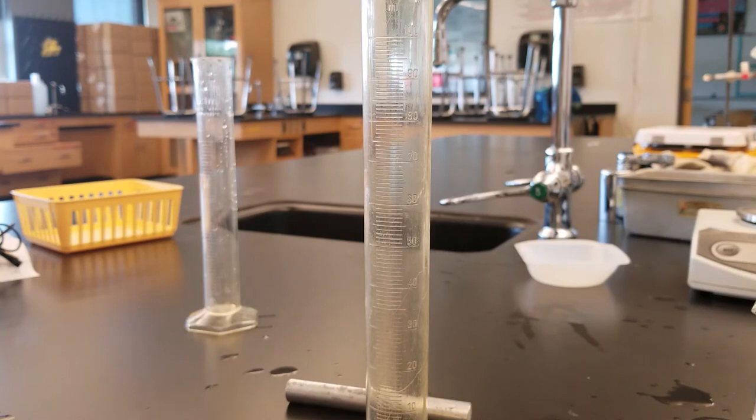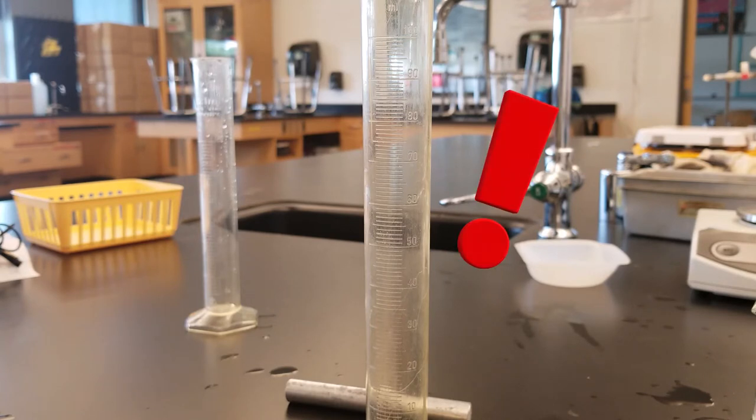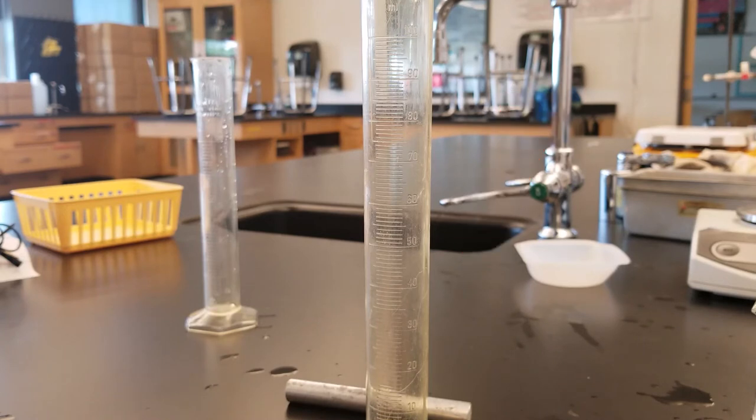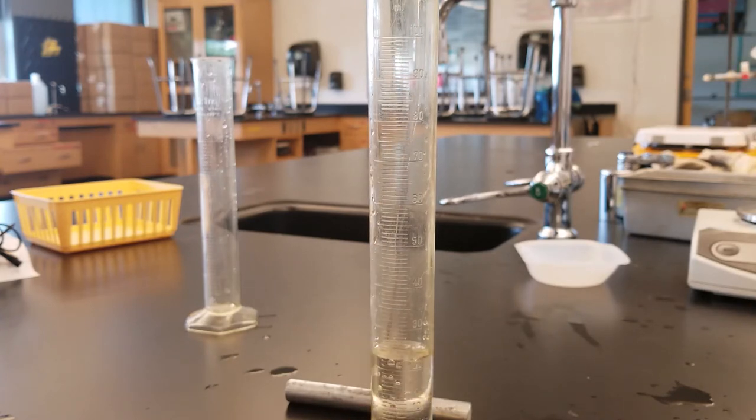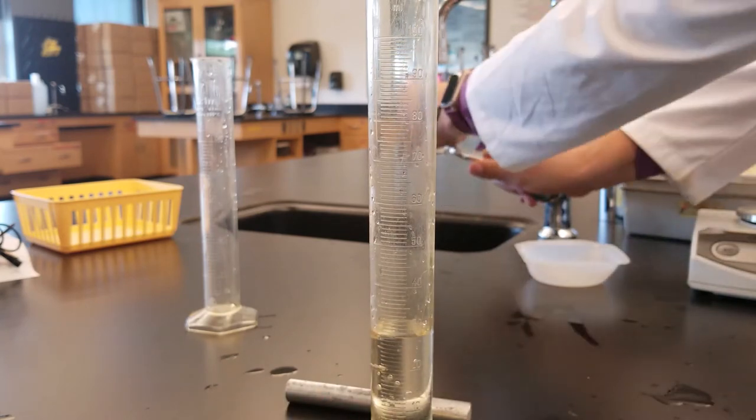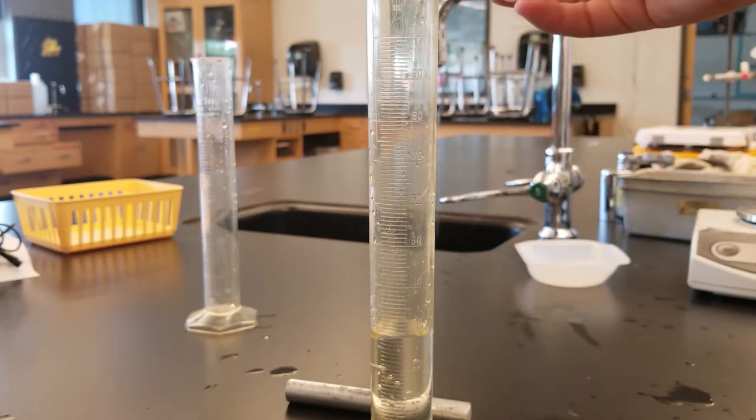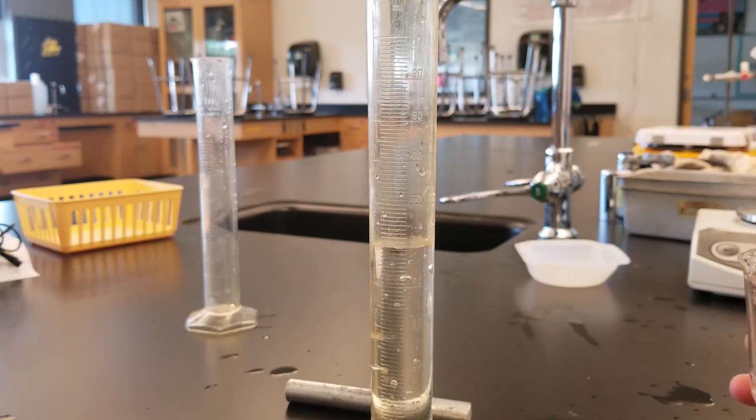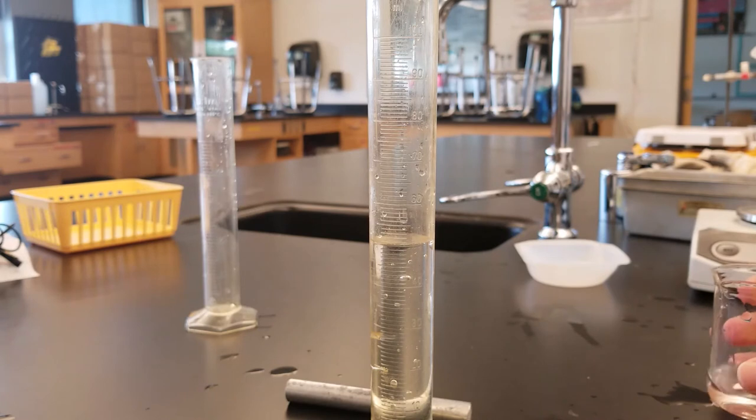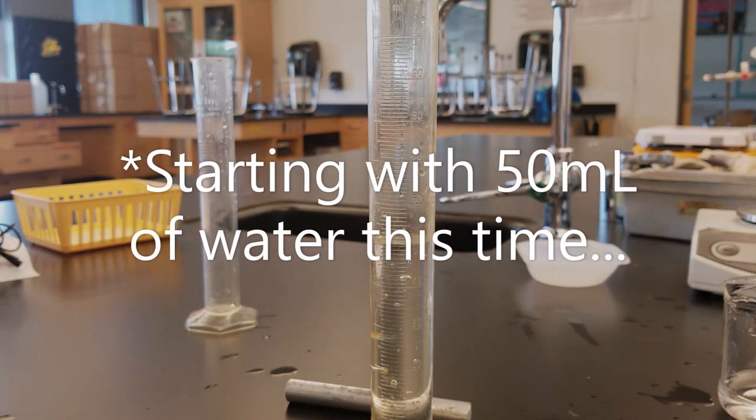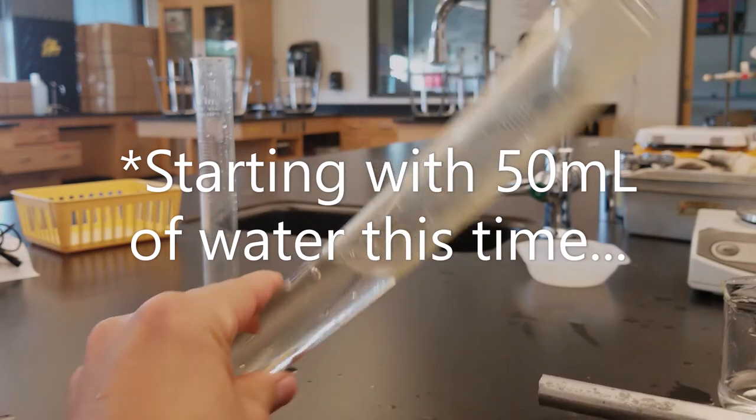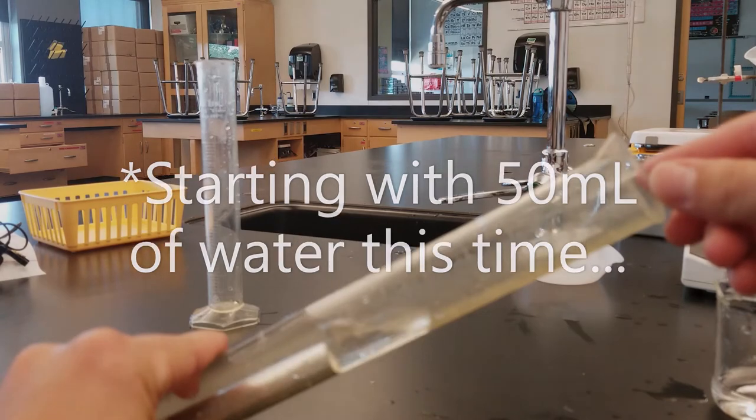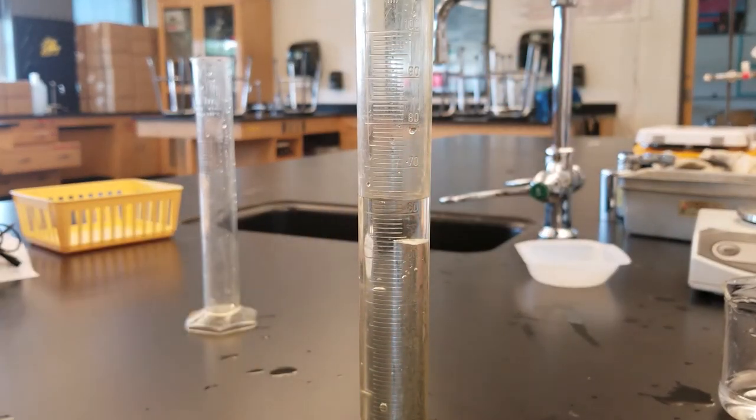Since object number five, the ten centimeter long silver rod is substantially larger than the others, it is recommended to use the larger one hundred milliliter capacity graduated cylinder. This time I'm going to put fifty milliliters of water in to start. Make sure to record the starting water volume as fifty milliliters. Remember this is an exception, not what we did for the first four. Turn at an angle, slide the largest object in, being careful not to splash, and then record this new volume.